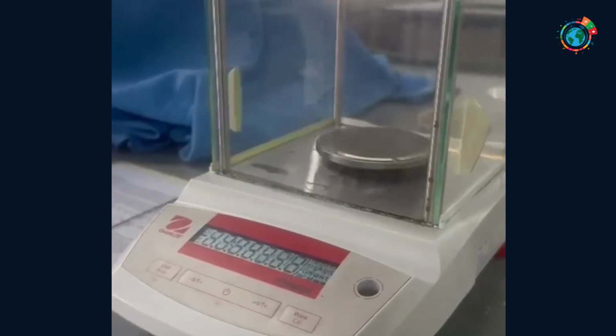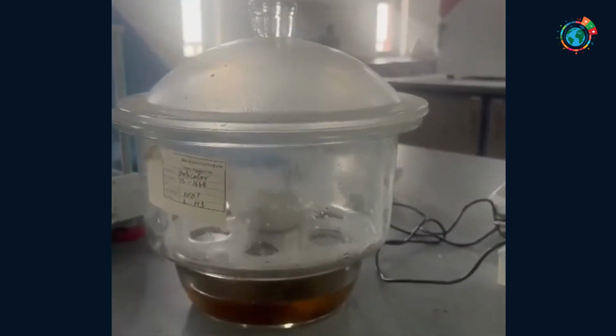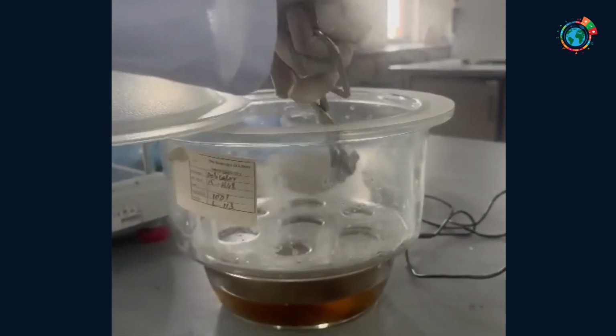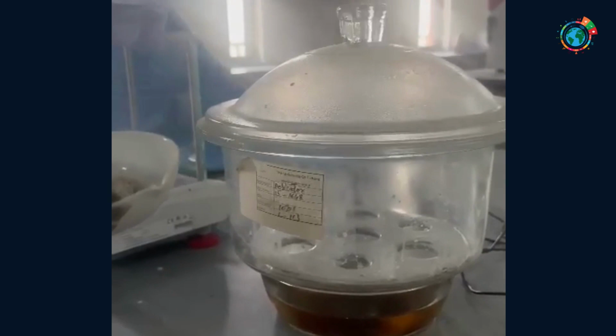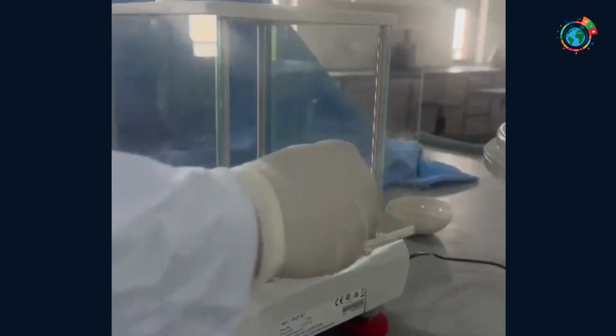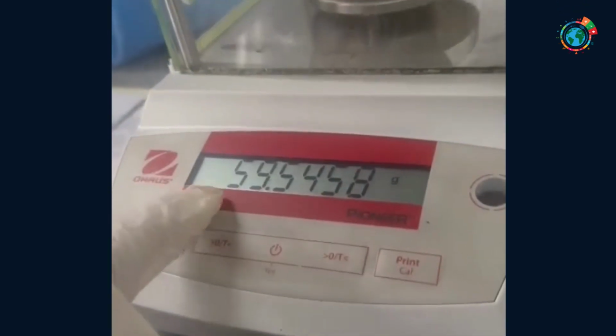After 30 to 45 minutes of cooling in a desiccator, it is time to note the final weight of the china dish containing the sample after drying. For this, calibrate the weighing balance to 0 and transfer the china dish to the weighing balance from the desiccator. Close the glass lid and note the final reading on the display of the weighing balance as the weight of the china dish plus the sample after drying.